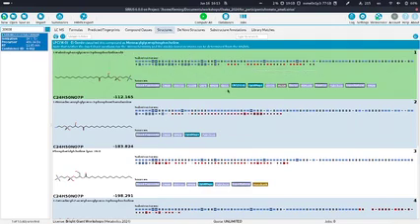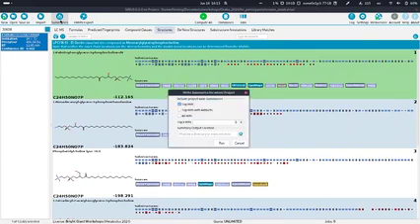Okay, and also just very quickly, you can export everything in these write export summary TSV files. So very important if you want to export everything, to analyze it in a different tool, to make some statistics and this kind of stuff.